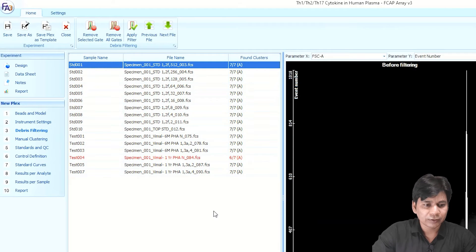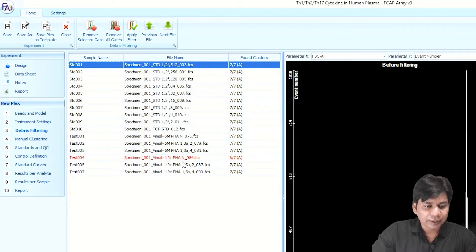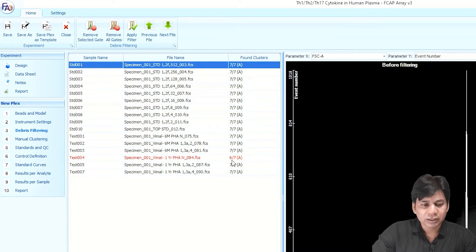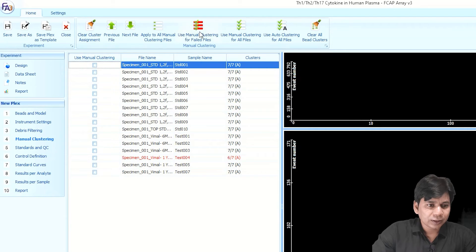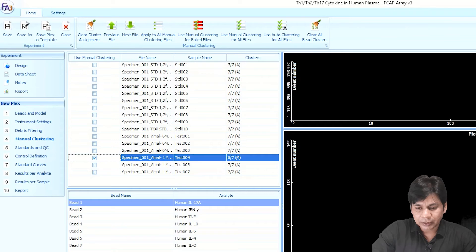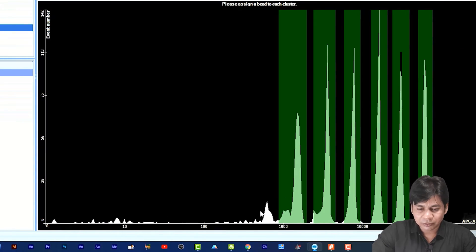After this, click on 'Debris Filtering.' You can see it automatically assigns clusters to all samples. If any sample is not fully clustered with all seven beads, it will appear highlighted — for example, test 004 is shown in red. You can see '6/7,' meaning only six out of seven clusters are assigned in this sample. You have to assign it manually. Click on 'Manual Clustering' and at the top select 'Use Manual Clustering for Failed Files.' You can see that in this sample only six clusters are assigned and the first cluster is not assigned.